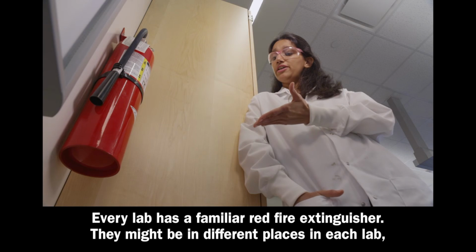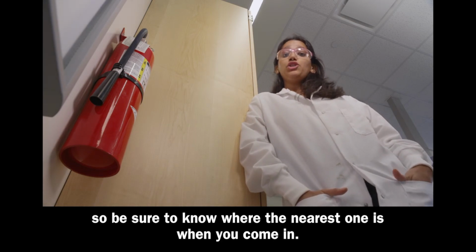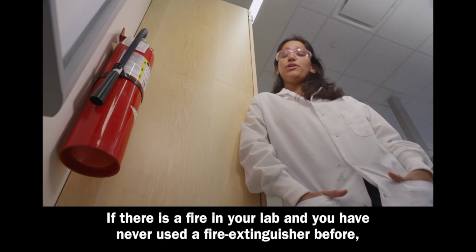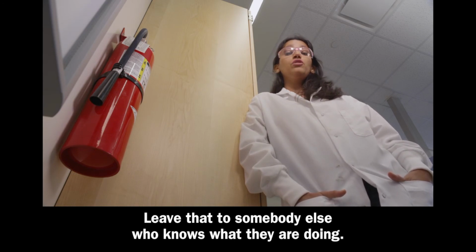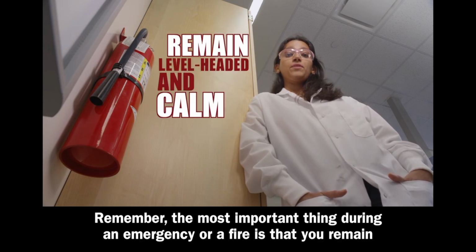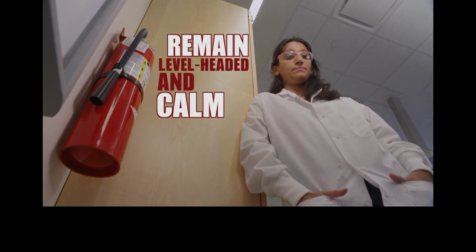Every lab has a familiar red fire extinguisher. They might be in different places in each lab, so be sure to know where the nearest one is when you come in. If there is a fire in your lab and you have never used a fire extinguisher before, do not pick that moment to learn how to use it. Leave that to somebody else who knows what they're doing. Go directly to the pre-arranged meeting place so that your instructor can see that you're safely out of the building. Remember, the most important thing during an emergency or a fire is that you remain level-headed and calm.